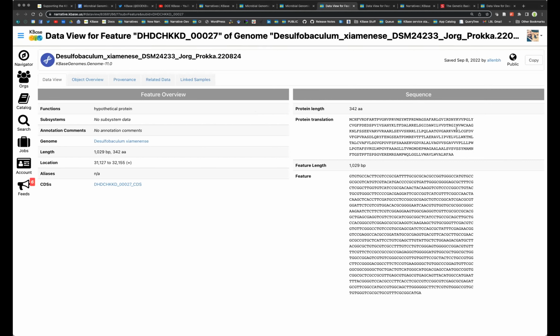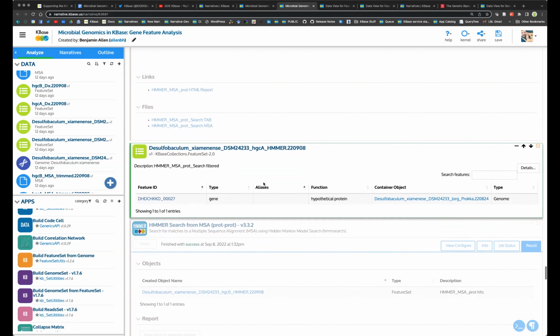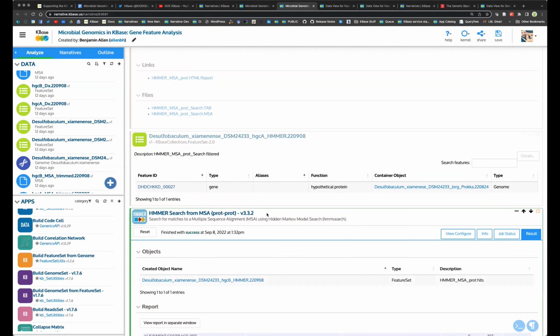That's kind of hard to look at here, but you can see this conserved region here. That was the highly conserved region that was established in the previous paper. But it's also just generally pretty close to the overall length that we had in our multiple sequence alignment that we used for the search.